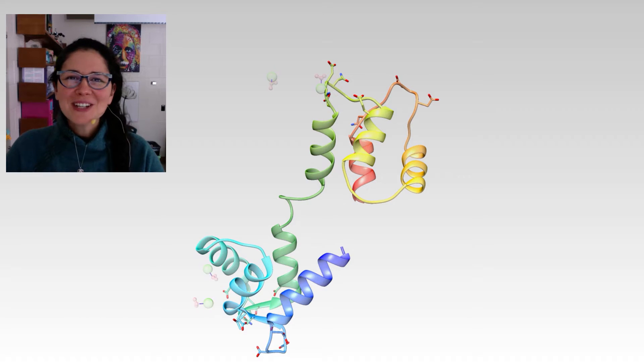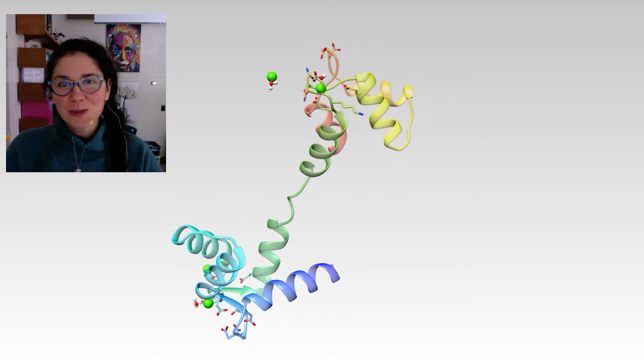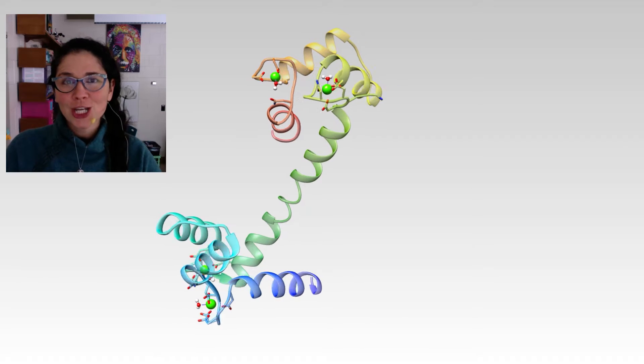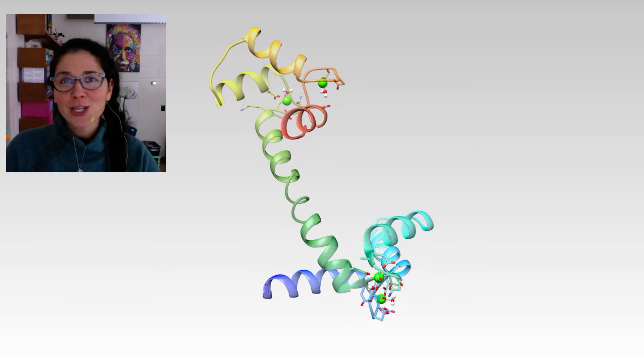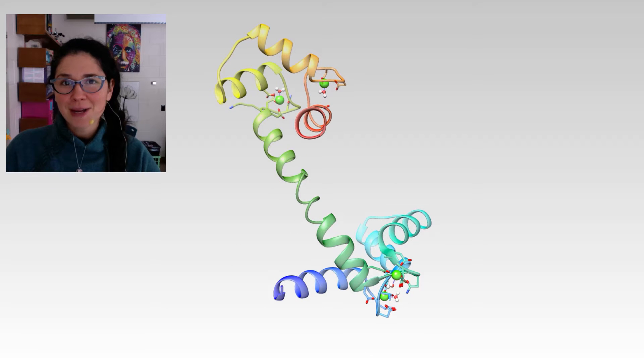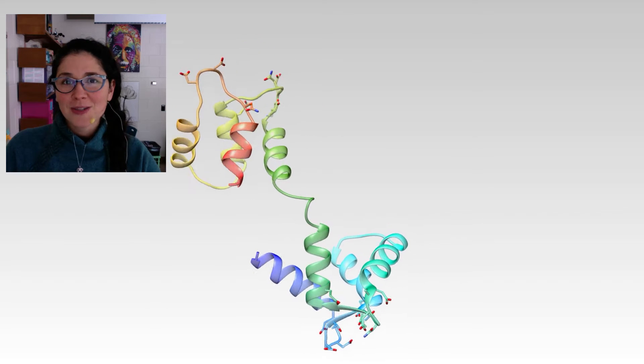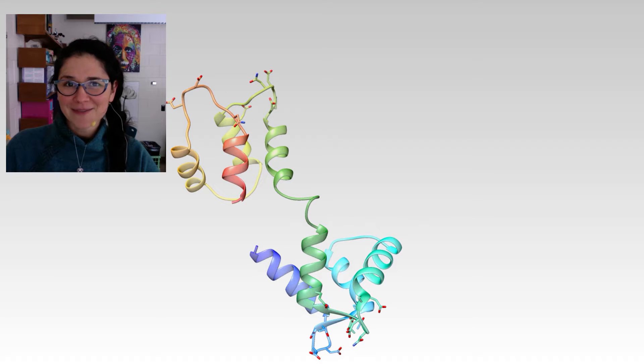Hi, I'm Dr. Katherine Haas. In this video, I'm going to show you how to animate a protein conformational change using the free software UCSF Chimera. The procedure shown in this video is the one I use to make the animation you're looking at right now.